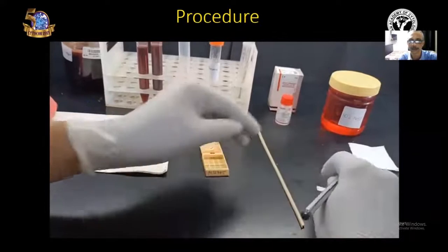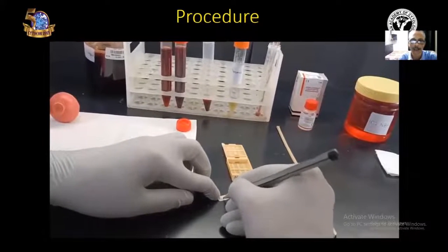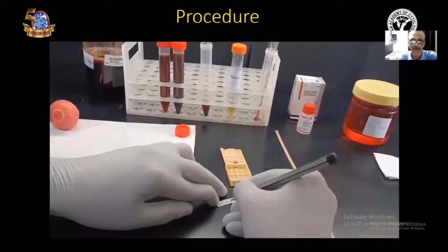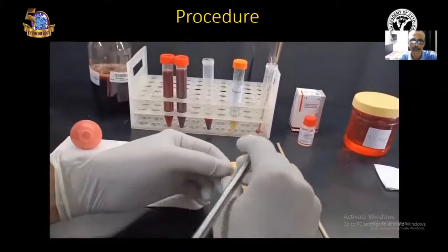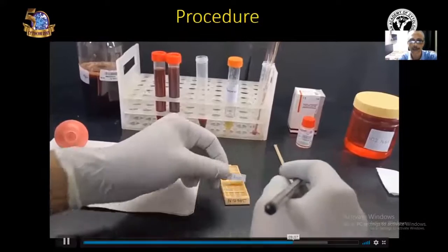The next step is put a small piece of cut paper and write the same label for labeling the tissue block and the label is put inside the tissue cassette.